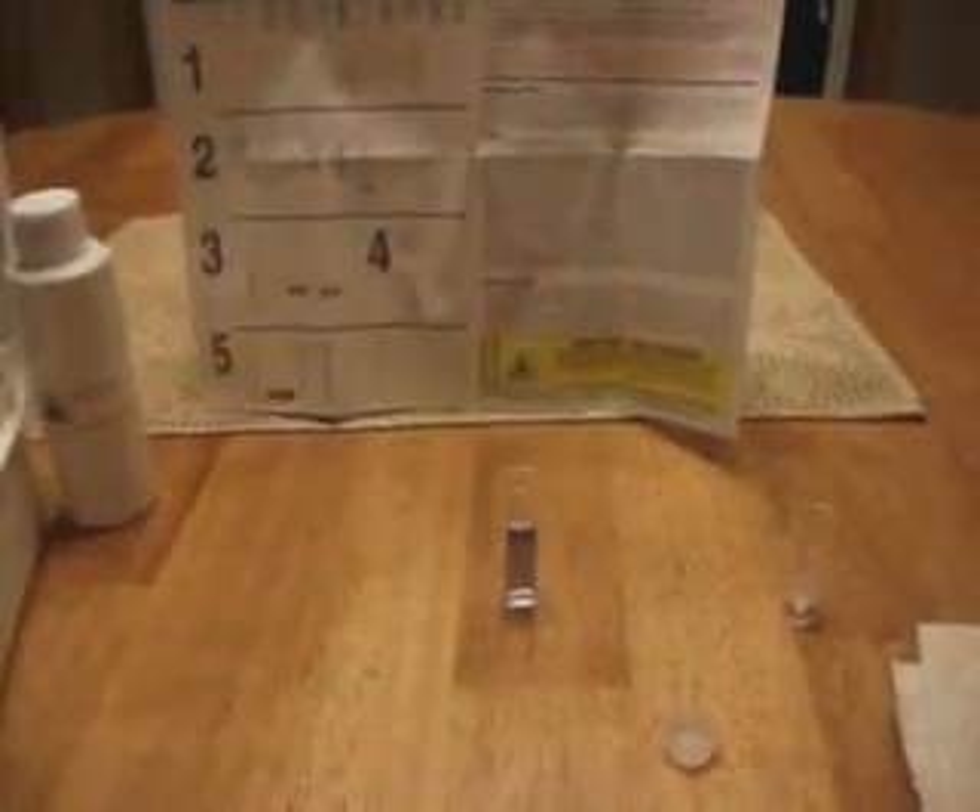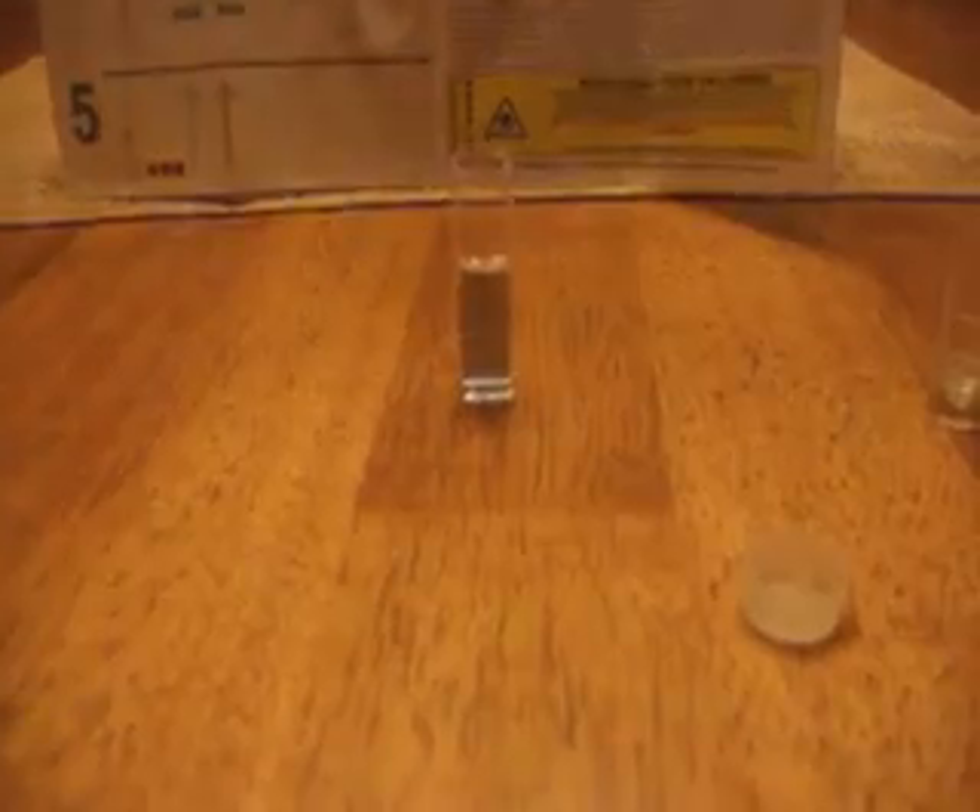Alright guys, it's 1977 Logan again. I'm back after using the Seachem magnesium test kit for the first time on the water that's in my aquarium right now. After you add your magnesium reagents one and two to your sample, you use this syringe which holds one milliliter of titrant.